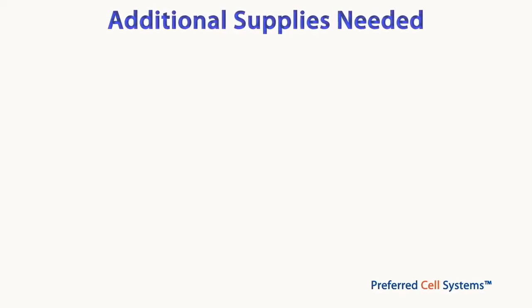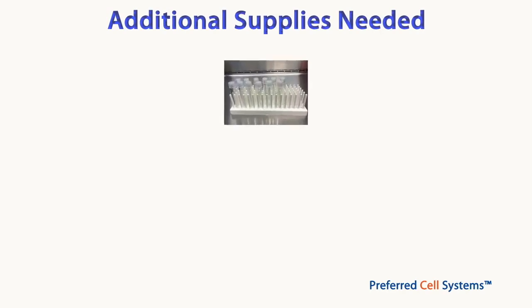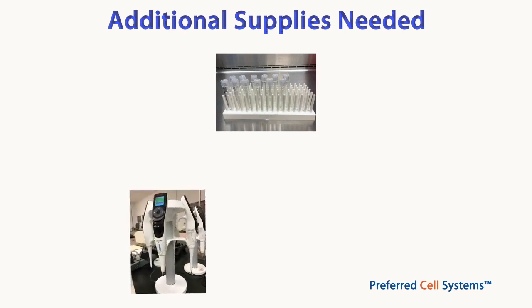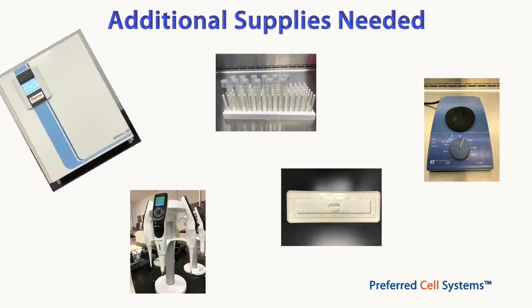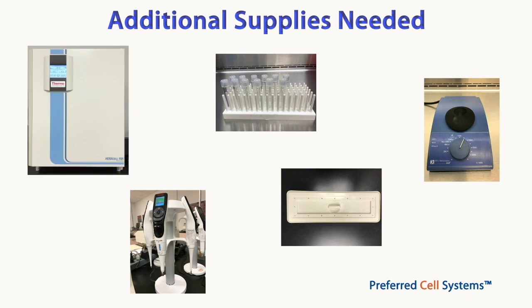You will also need the following supplies: 12 5 ml sterile plastic tubes with lids, single channel pipettes with sterile tips. We recommend using either professionally calibrated manual pipettes or electronic pipettes. The latter are best since they self-calibrate every time they are used. However, all pipettes should be calibrated at regular intervals. You'll need a vortex mixer. You'll also need a humidified chamber, the construction of which can be found in the technical manual. A humidified incubator at 37 degrees Celsius, containing an atmosphere of 5% CO2 and, if possible, 5% O2 is also required. The low oxygen tension reduces oxygen toxicity and increases plating efficiency. Finally, you'll need your sample cell preparation and the reference standard cell preparation.